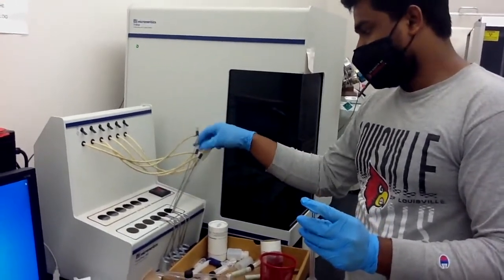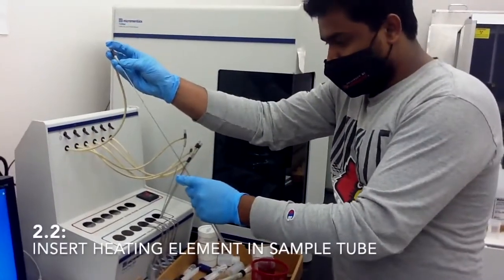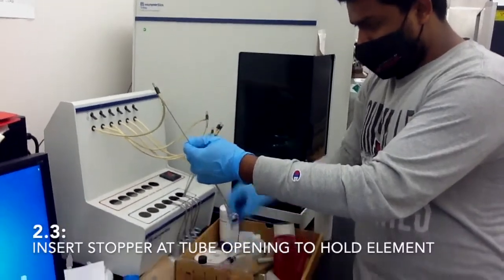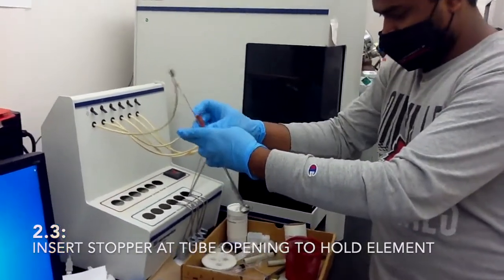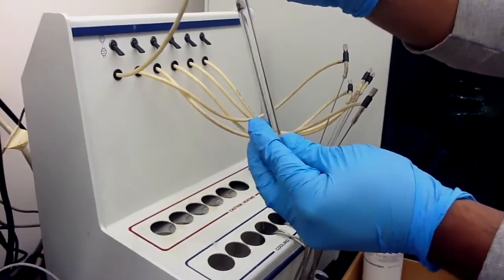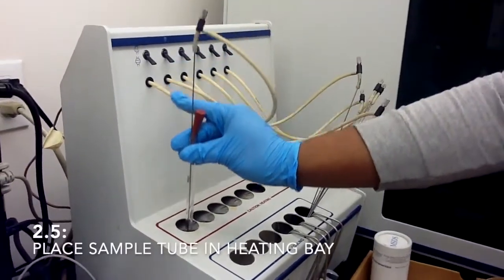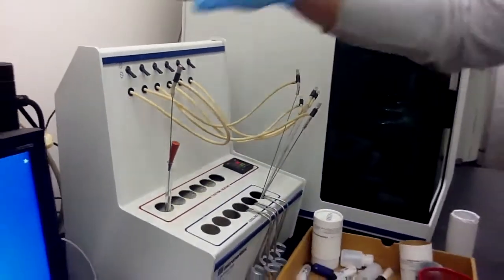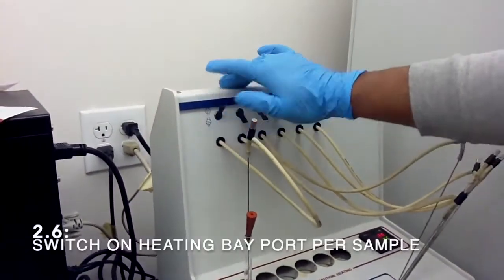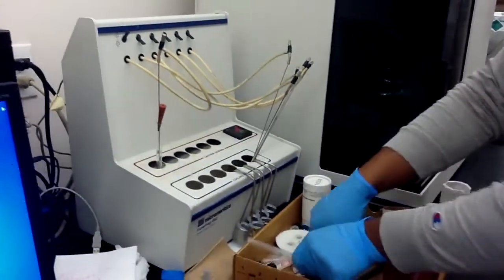At first, suppose this is my sample inside this tube. I will put this tube here and put a rubber pot here. Make sure this tip of the rod does not touch the sample. So just hold it like this and then put it here. Now this is in the closed condition. You can see this is closed. All you have to do is open it. Okay. If you have three tubes, just put them in the same way.